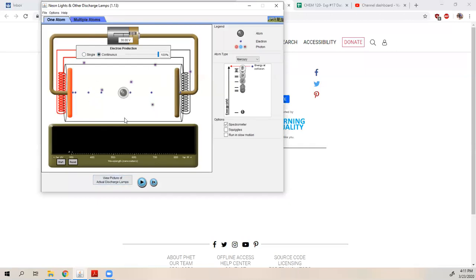And so this is a discharge lamp. What's happening is we're exciting electrons, and those electrons are going to hit this element here, or our atom, and we're going to try to excite them forward. So we're trying to add in these electrons to make this atom get excited and then maybe discharge something. We're trying to bounce out electrons, things along those lines.